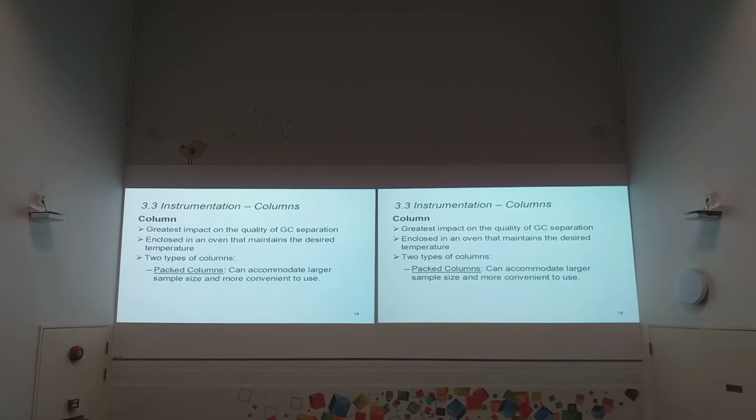Then the capillary column can give you very high separation efficiency, and it saves you a lot of the product. So you don't need a lot of product, which also brings down your product analysis cost.